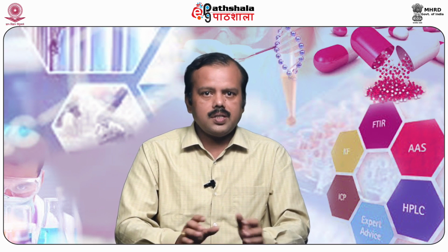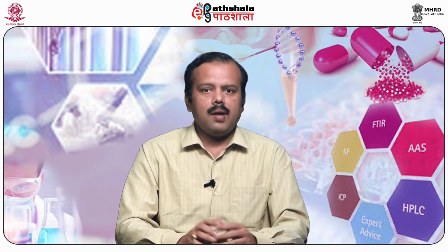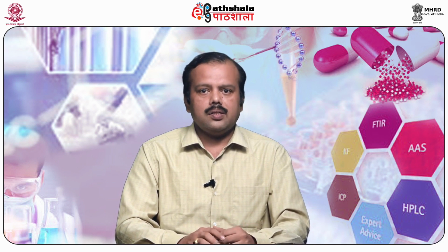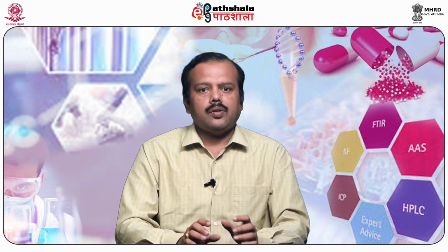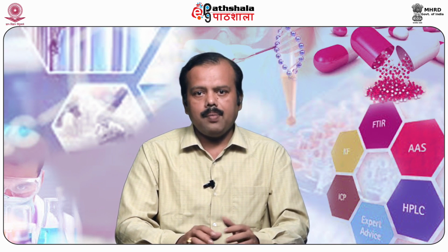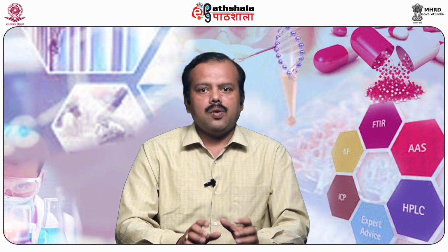It is suggested that decontamination should be carried out by autoclaving at 121 degrees centigrade for 60 minutes. After autoclaving, media may be disposed of through normal waste disposal or by incineration. When disposing of slant cultures, remove the cap and turn the tubes upside down in the baskets. Place the caps in a separate container, then separate the slant tubes by size.